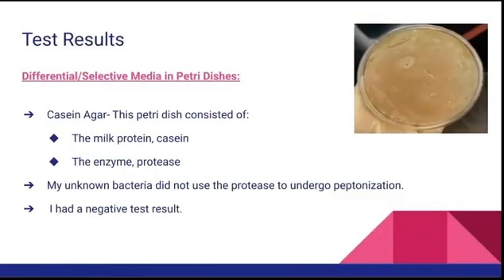Some more tests that I performed were in petri dishes through differential and selective media. One kind of media I used was casein agar, and my bacteria had a negative test result — no clear halo formed around my bacteria, so it did not utilize the enzyme protease and did not undergo peptinization.